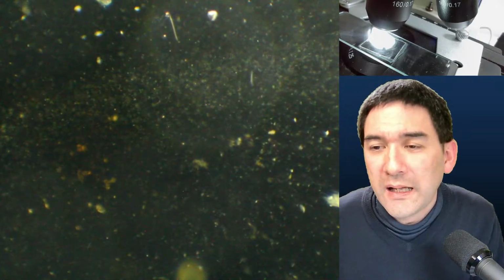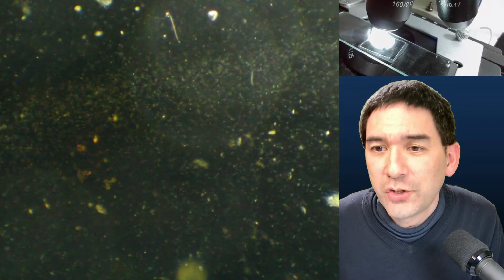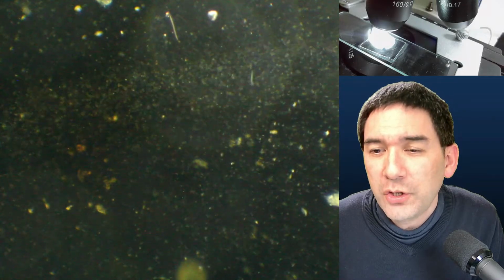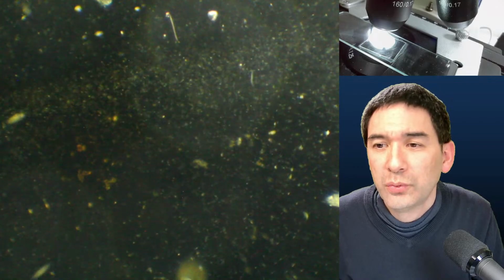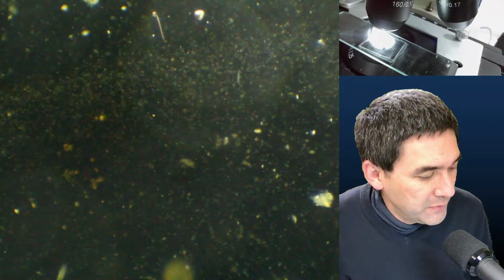I love the moon landscape effect. Oh, that's an interesting analogy here, of oblique illumination and with a colored plastic on top of the light. So much fun. I'm going to make a multicolored ruler to move manually over the light. Let me try the following. Instead of using the dark one, let me use the blue one. And then I think I'm just going to call it quits for today.